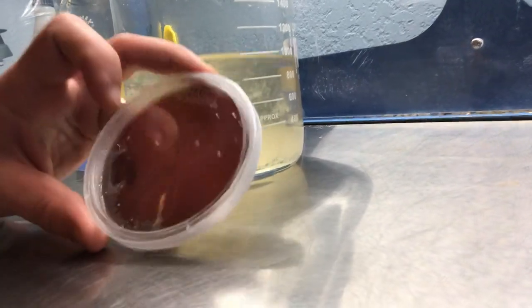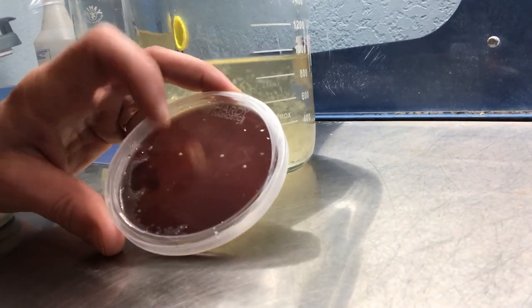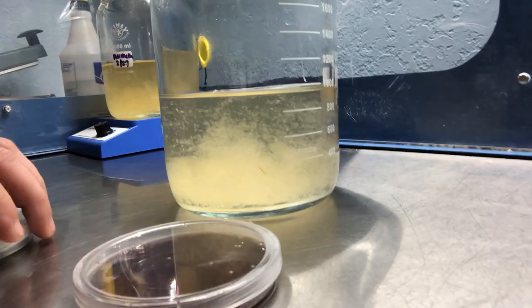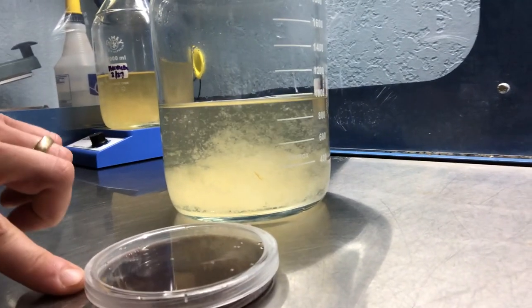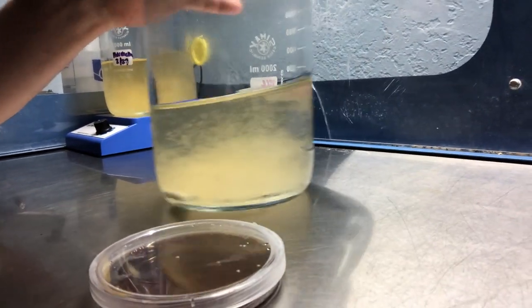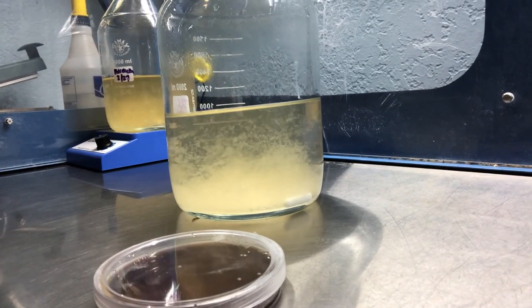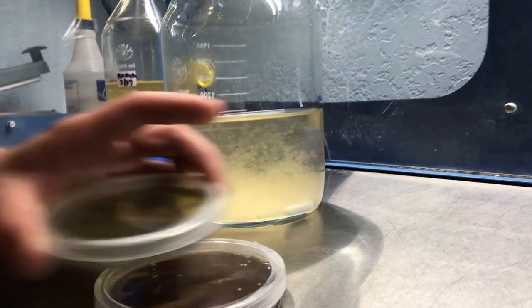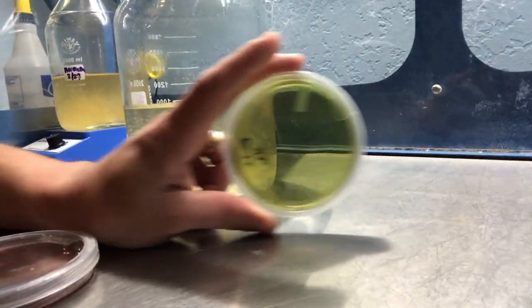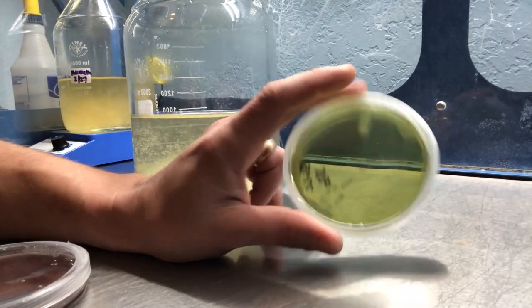But if you look at the blood agar plate, you can see some colonies right here. So there's, you know, six colonies, maybe 600 CFUs, which probably didn't look like much when I was taking out the sample for quality control. But over the next few days, it kind of blossomed into this big bloom. And then if I look at the Salmonella and E. coli plate, that is clean. So I know that it's not, you know, Salmonella and E. coli, which is really good.